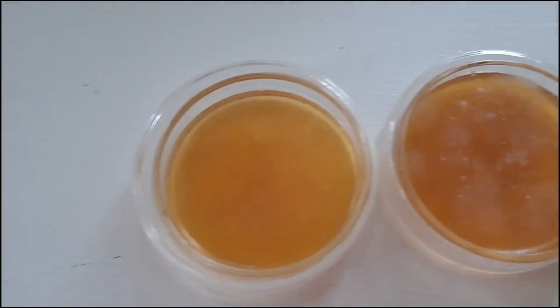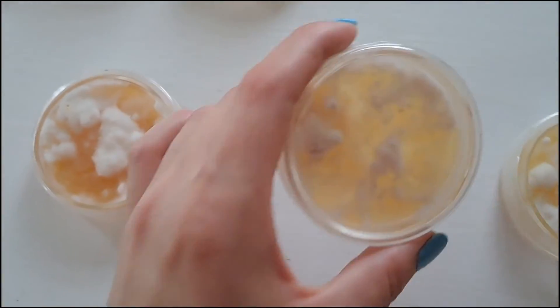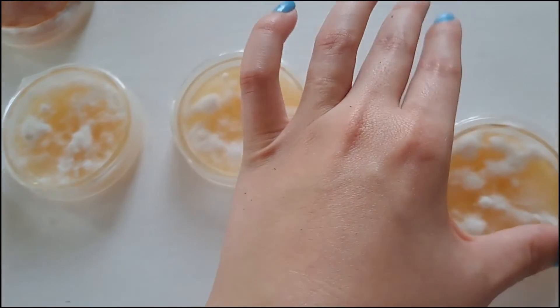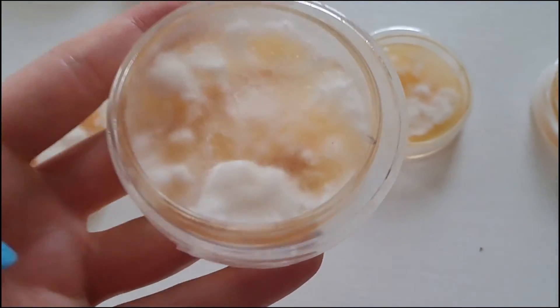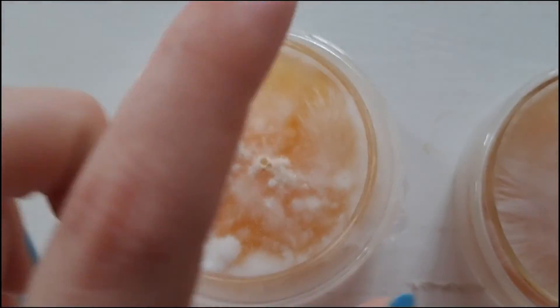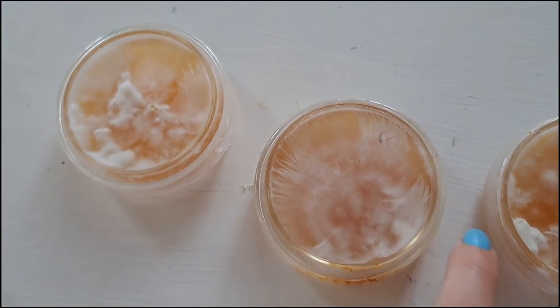Here are the results of that first batch. Some didn't grow anything, some just grew slime mold. Some grew but didn't produce the rhizomorphic growth I wanted — more tomentose. I think the syringe is about three years old and has been in my fridge a while, so I'm just finishing it up. There is growth there and I could transfer it. Then here are the ones I want to take transfers from — you can see there is rhizomorphic growth. This one has a lot on the sides; I may have left these petri dishes a bit long and should have taken transfers earlier.